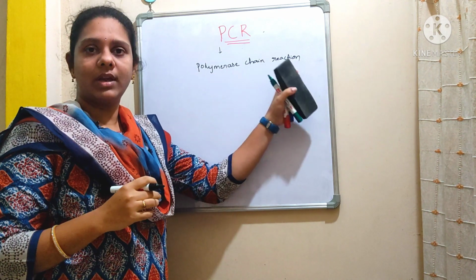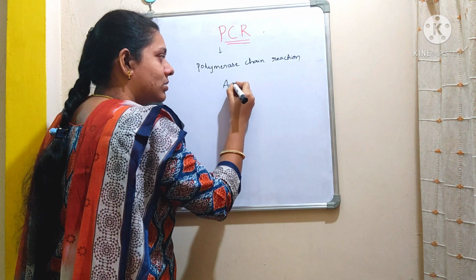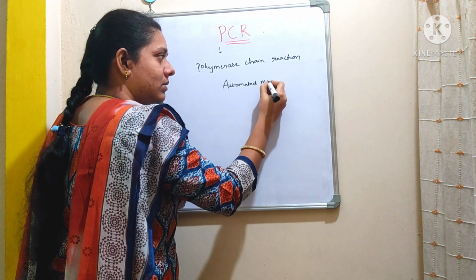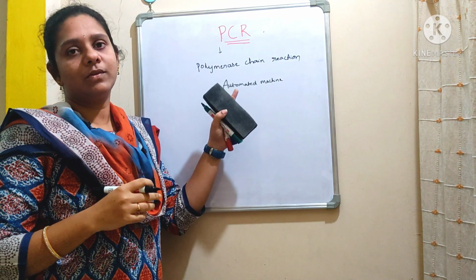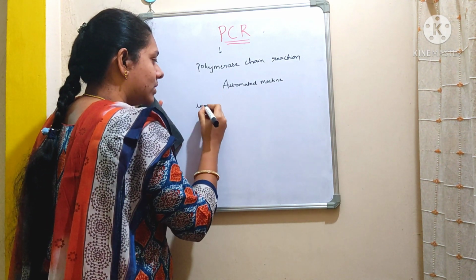Polymerase chain reaction. So this PCR is an automated machine where the DNA synthesis will take place under in vitro conditions.